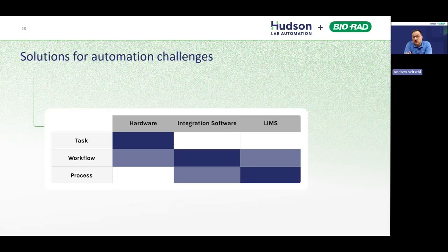That doesn't mean that you avoid all the work that we've been talking about before, right? Because that workflow automation, you still have to break down the problem correctly. You still have to have the right organizational support. Kind of the next phase is looking at, I'll call it integration software, which software is maybe a little bit of a misnomer here, because there is equipment that's designed specifically for workflow-based automation, right?